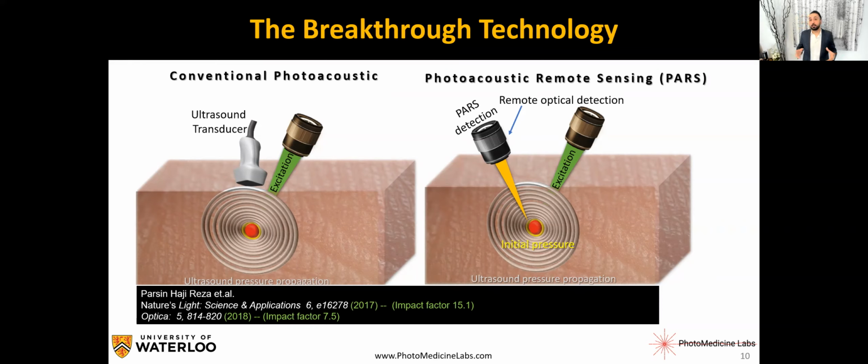So this is very exciting. This means now we have a non-contact technique. We can have a few centimeters of working space. Again, PARS has very different modalities. We can actually detect initial pressure as well as the surface oscillation due to the traveling of this ultrasound pressure propagation. But in this case, we only focus on one of the simplest methods. So how has that been invented? Basically by accident. When I was doing my PhD at the University of Alberta under Dr.